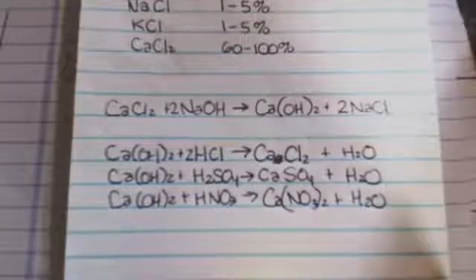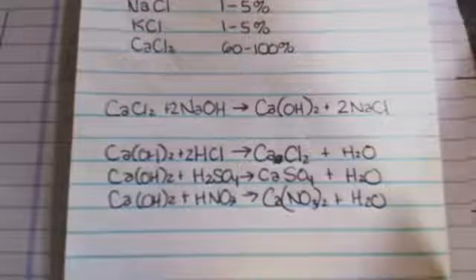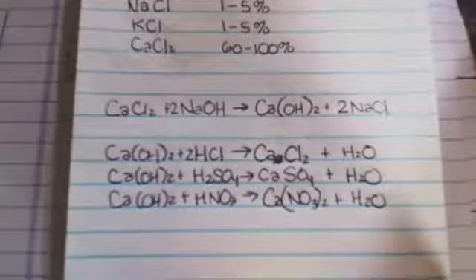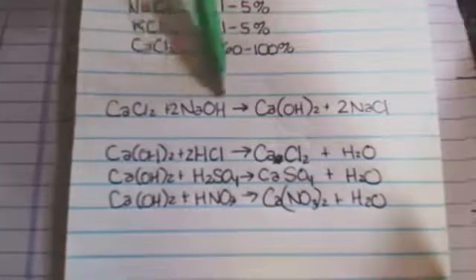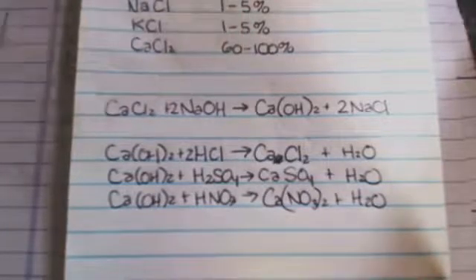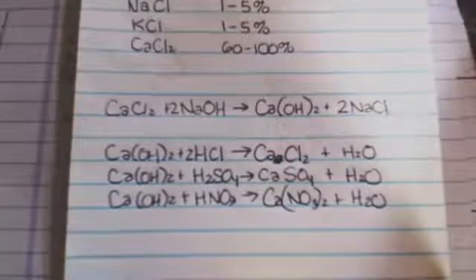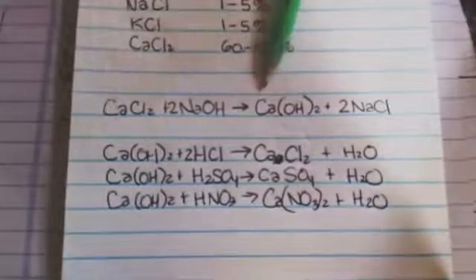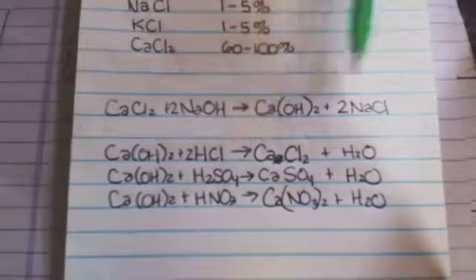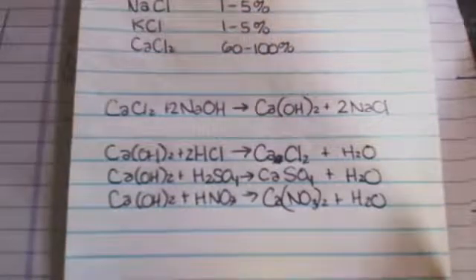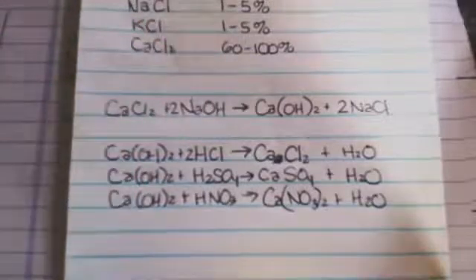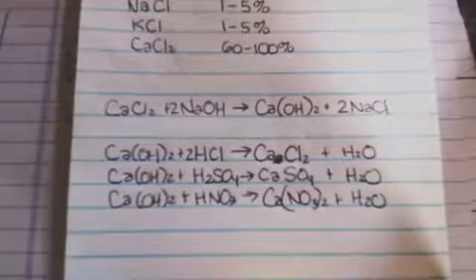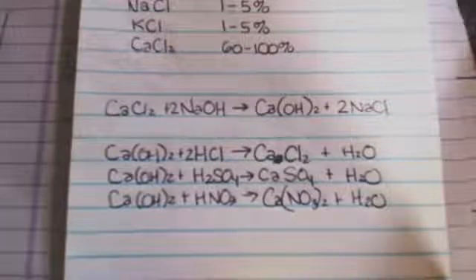Another thing that calcium chloride DampRid is good for is it's a source of calcium for calcium salts. So if you take your calcium chloride and you mix it with some sodium hydroxide—remember we make chromium hydroxide this way—what will happen is the calcium hydroxide precipitates out and the sodium chloride stays in solution. Then you can mix that with any acid you want to make your salt.